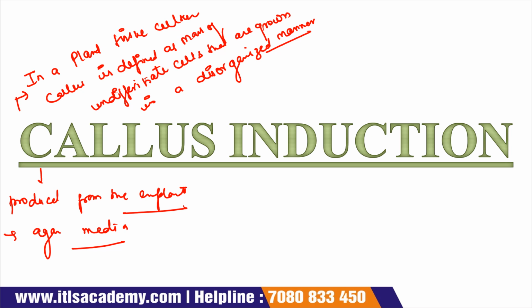So simply, callus is a defined mass of undifferentiated cells. These undifferentiated cells are grown in a disorganized manner, produced from an explant, and can be grown on an agar media.